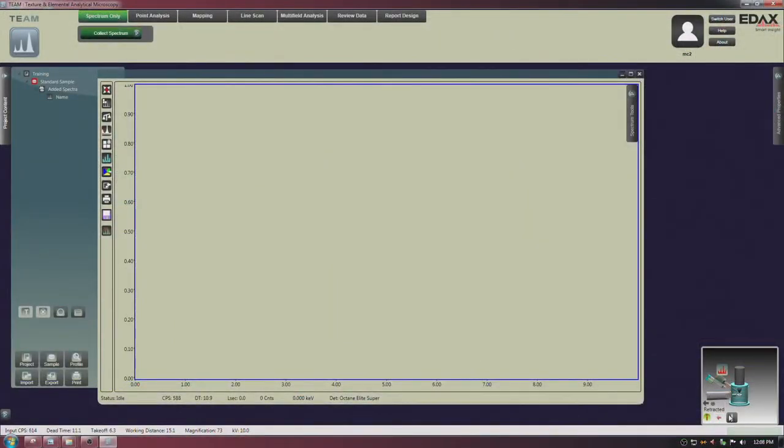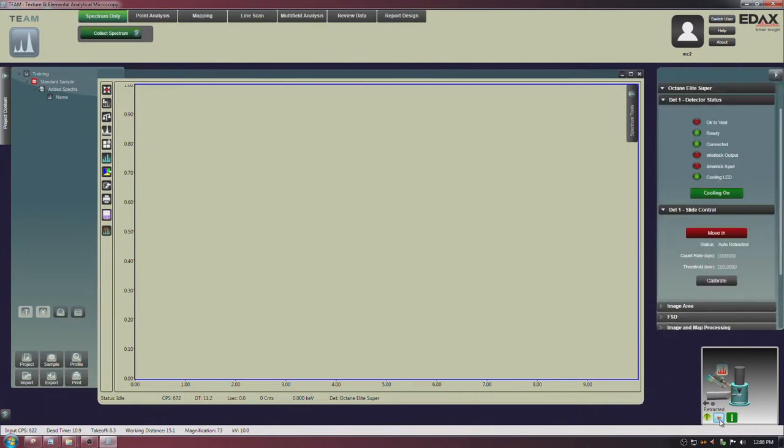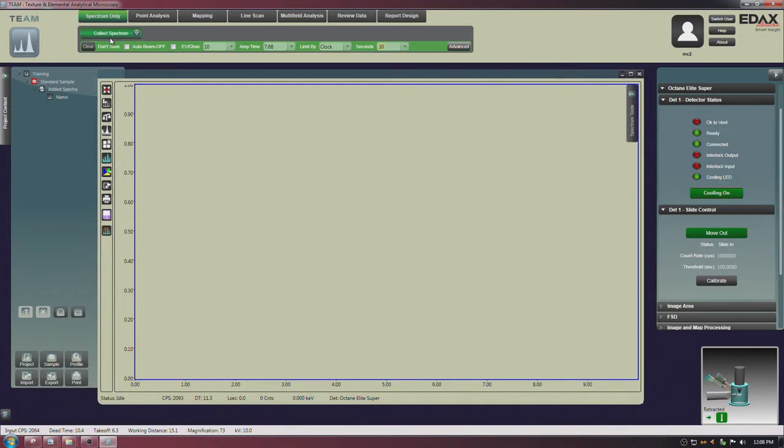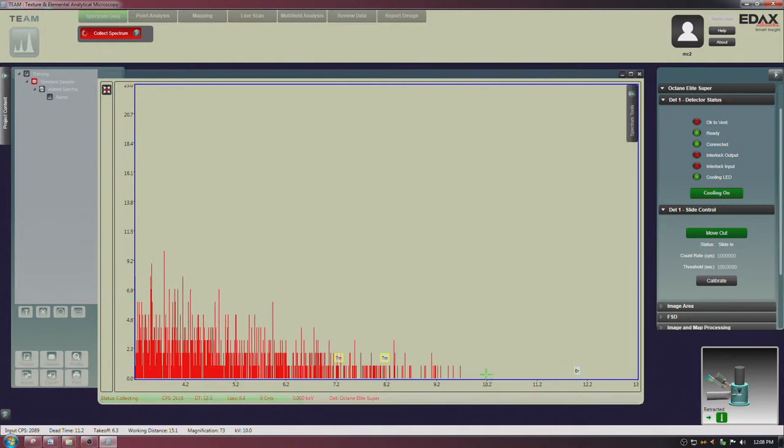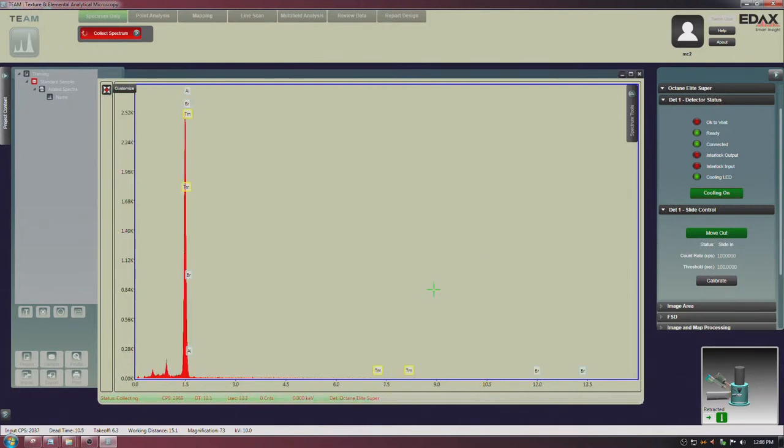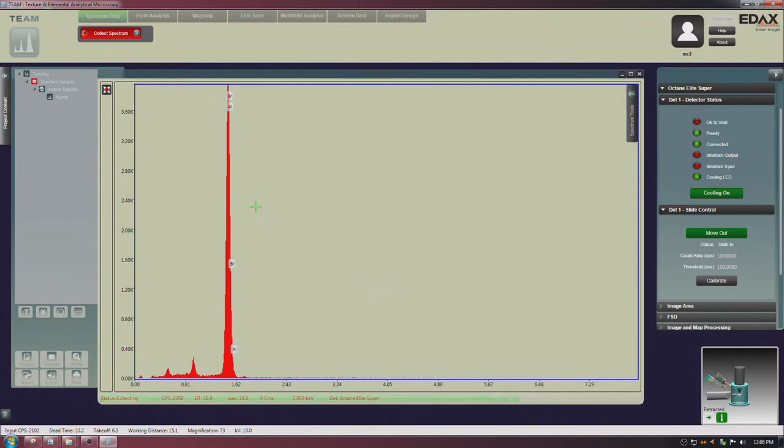I'll collect a quick spectrum. We're at 10 kV, so we will get no X-rays higher than 10 kV — if I zoom up you can see it starts to drop off there. This is called the Duane-Hunt limit: you cannot have any X-rays higher energy than your incoming electron beam. This green progress bar needs to finish before I start doing any line identification. One of the classic mischaracterizations in EDS is the identification of bromine — it overlaps directly with aluminum.